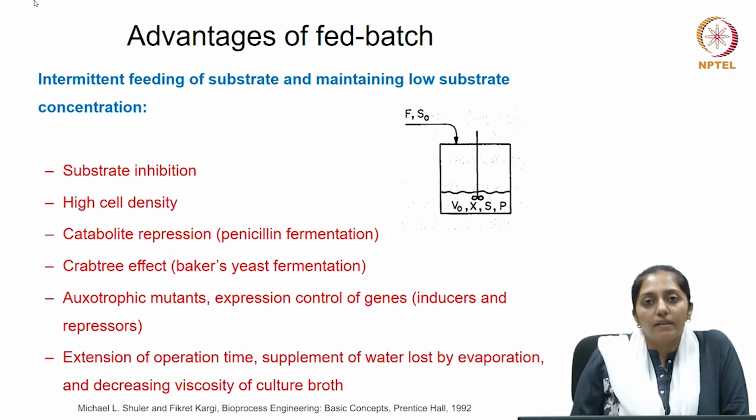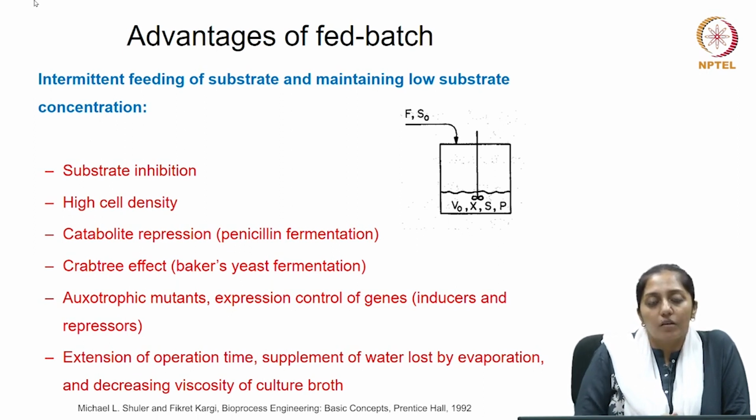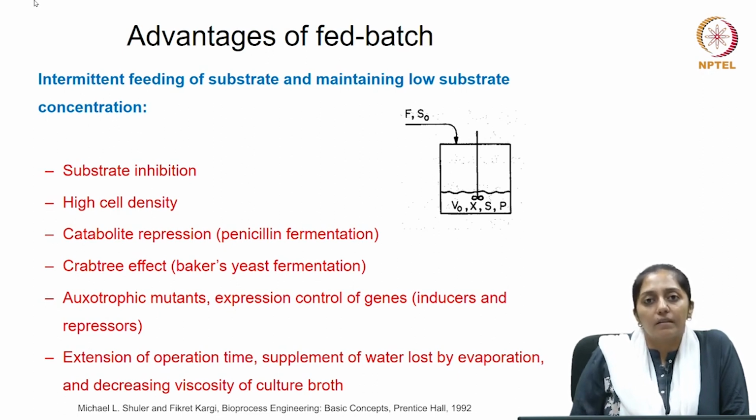So, to avoid that, the glucose concentration has to be kept under the levels where the Crabtree effect starts happening, which is an undesirable effect, because if substrate level phosphorylation starts happening, then ethanol as a byproduct will start getting formed, because of which there can be toxicity and the pH might change, the flavor might change, which is a disadvantage.